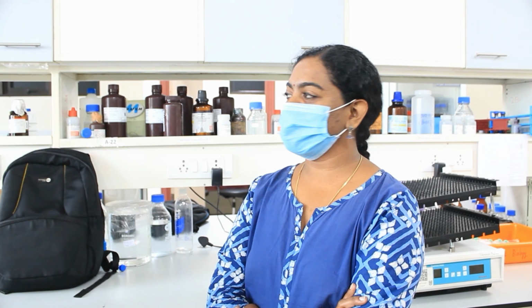We spoke to Ms. Nityarani NM, Technical Assistant Biology, to know more about the segregation of biowaste in iGEM biolabs. Ma'am, so how exactly is the waste segregated in our biolab?